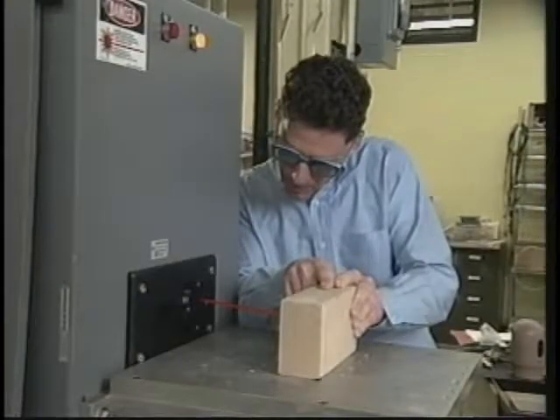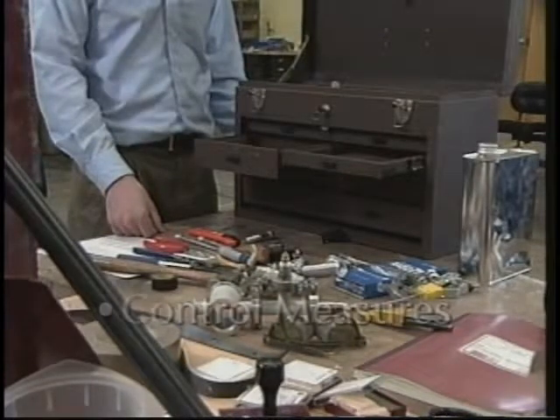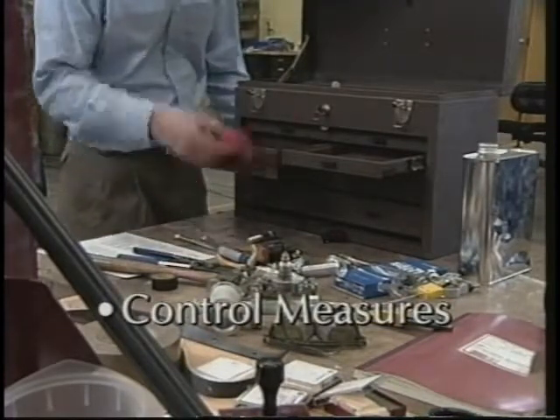Terminate the beam with a beam stop and use a temporary barrier to reduce the likelihood of projecting the beam across open areas. Tools cluttering the work area can create unexpected specular reflections. Make sure to put tools away.